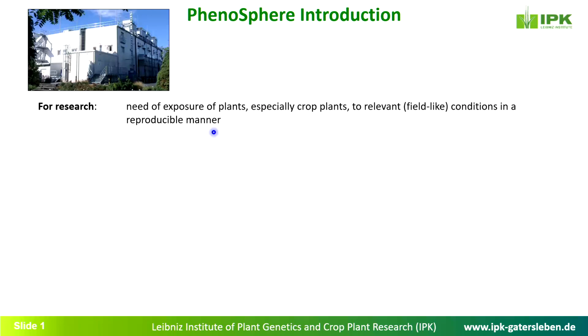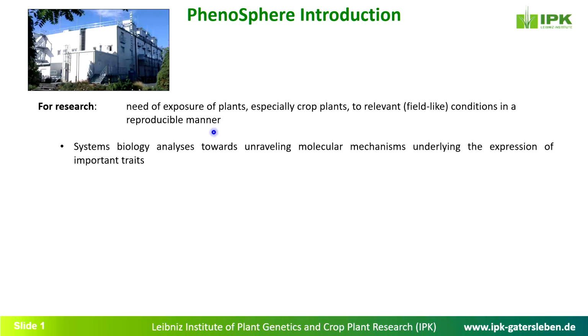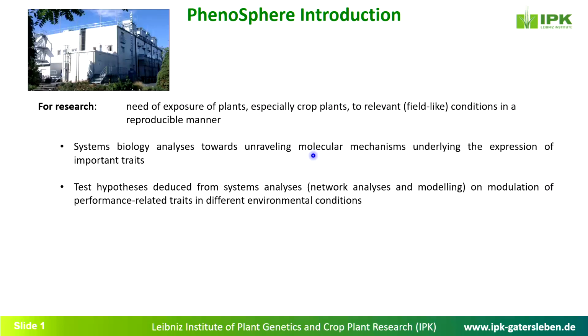So first of all, what is the need for PhenoSphere? Obviously, the natural environment would be the field. But for example, for research purposes, there is a need of exposure of plants, especially crop plants, to relevant field-like conditions in a reproducible manner, to answer questions like for systems biology analysis, towards unraveling molecular mechanisms underlying the expression of important traits, or to test hypotheses deduced from these analyses on modulation of performance-related traits in different environmental conditions.